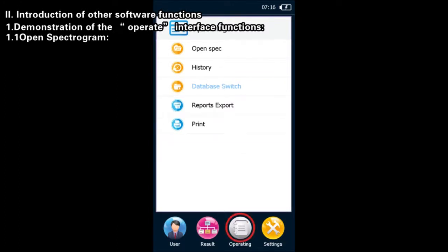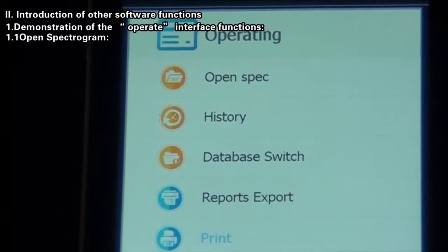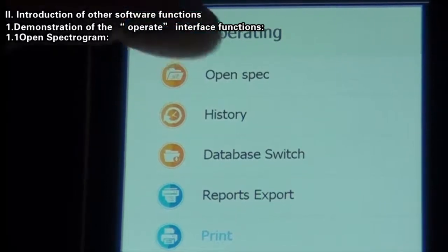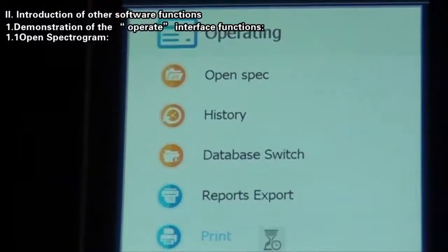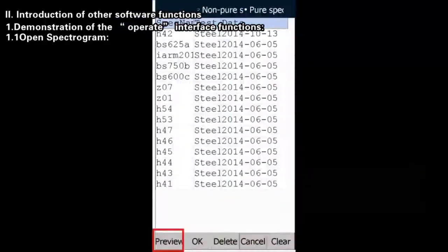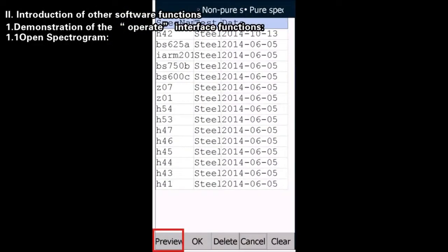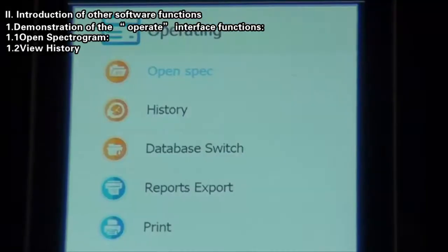Open Spectrogram: Click the Open Spectrogram to view the previously scanned spectrograms. Select the Spectrogram and click the Preview button to preview the shape of spectrogram. Select the Spectrogram and click the OK button to view the test results of this sample.